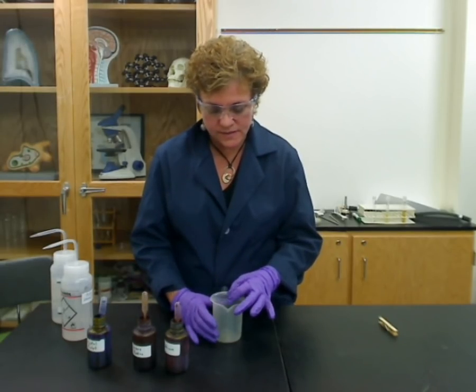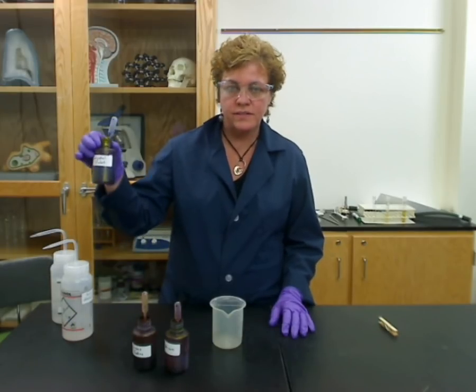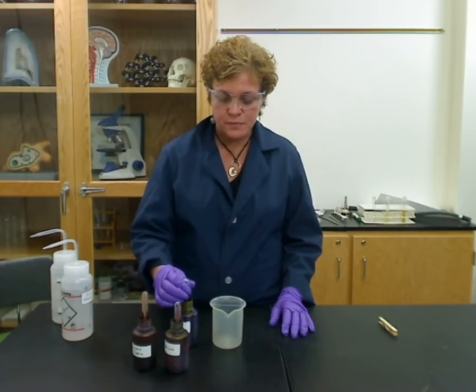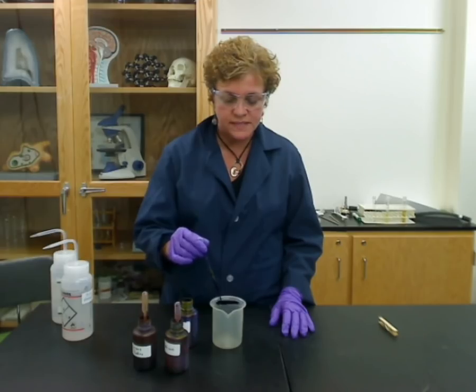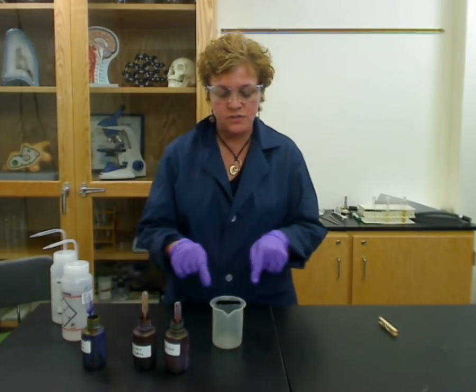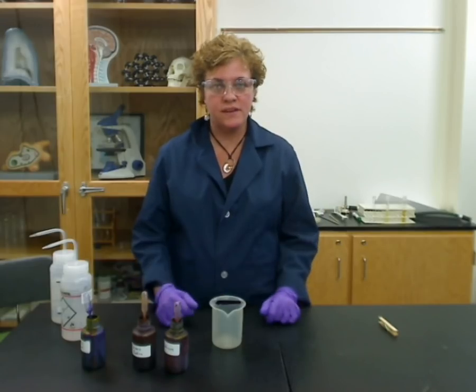Make sure that the slide fits pretty well on top of the beaker. The first thing you're going to add is something called crystal violet. Crystal violet is a very purple stain — and yes, it will stain your clothes. You're going to add it to the top and make sure that you basically cover the whole area that had the bacterial smear on it. Then you leave this on for a minute.